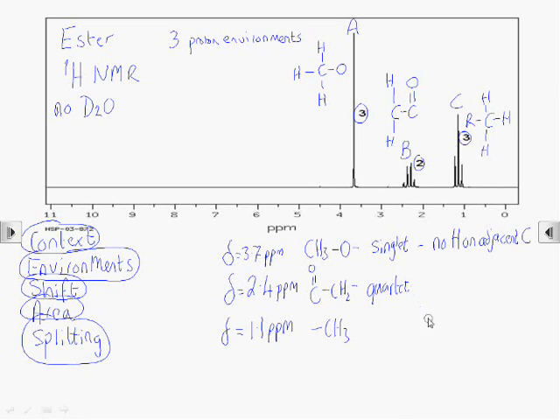Peak B is a quartet. That tells us there are three hydrogens on the carbon adjacent to this. So it's looking very much like the methyl group is connected to that CH2.